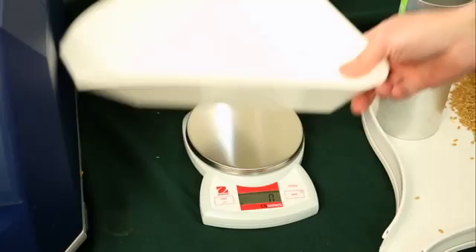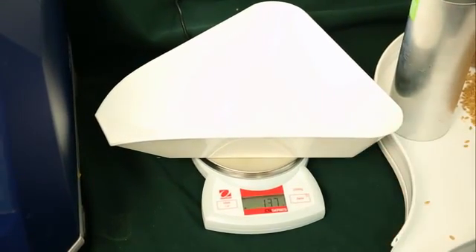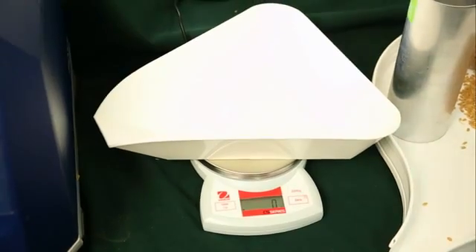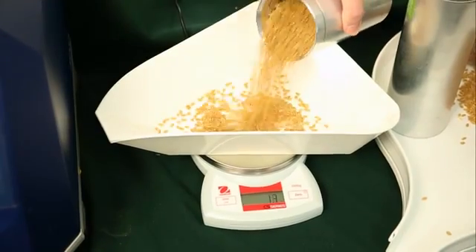Now I'm going to tare this container on the balance. Done. And now pour your 500ml sample into the container.